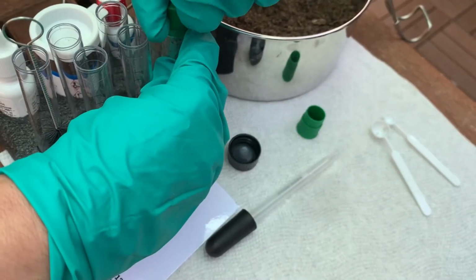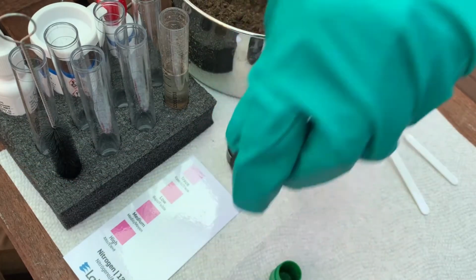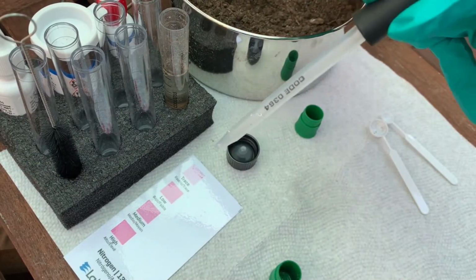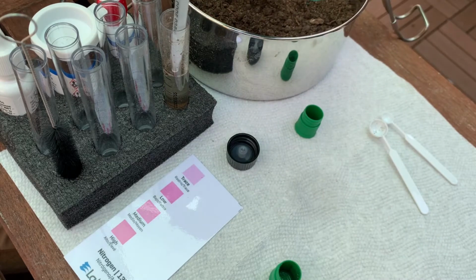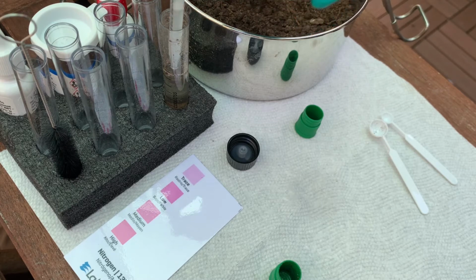So then you remove the cap and you allow the soil to settle so that you'll be able to extract liquid with the pipette. Now every time you do this, use a different pipette, use a clean pipette. And we're going to transfer the clear liquid to a second test tube.